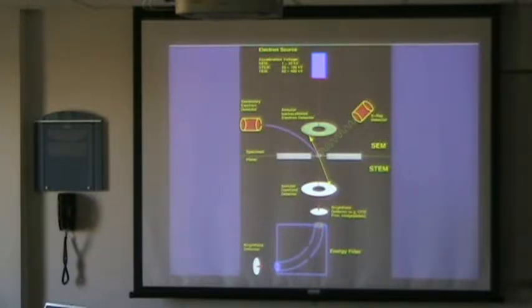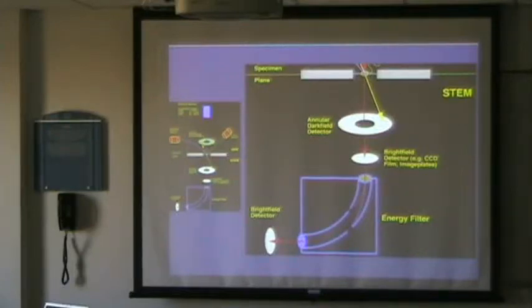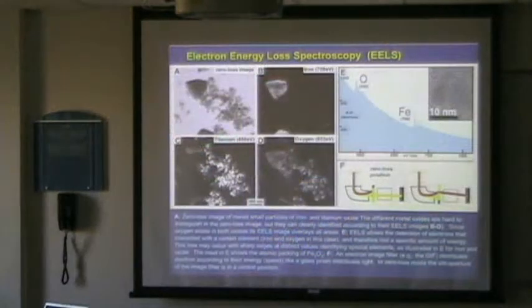And that's a good way of selecting elastically scattered electrons, the ones we actually want, from the inelastically scattered electrons, because they have actually lost energy, so they're not at the same speed anymore. And also secondary electrons. All the secondary electrons are typically not a big problem. When you do this energy filter, that's again this energy filter system, and then you can actually have your CCD back here, and you collect your image back there. And with this thing, you can do a few interesting things.